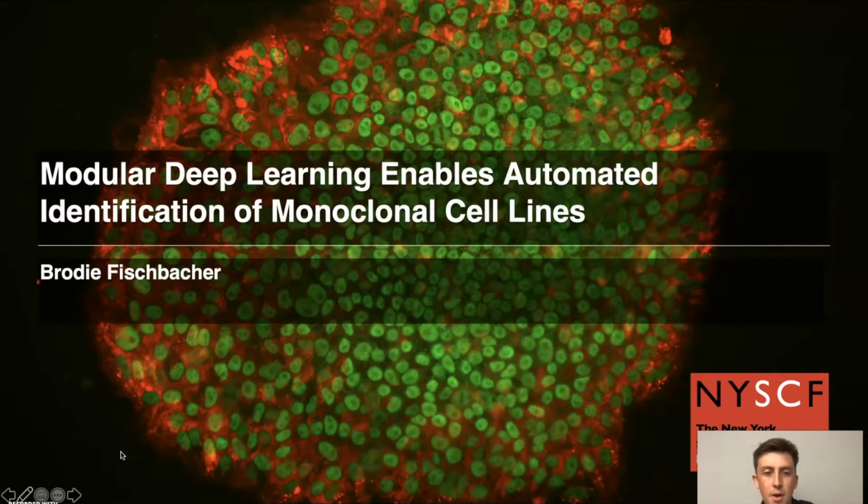I'm going to speak to you today about a kind of modular deep learning workflow that's been built at NYSCF for the automation of verifying monoclonality in cell lines.